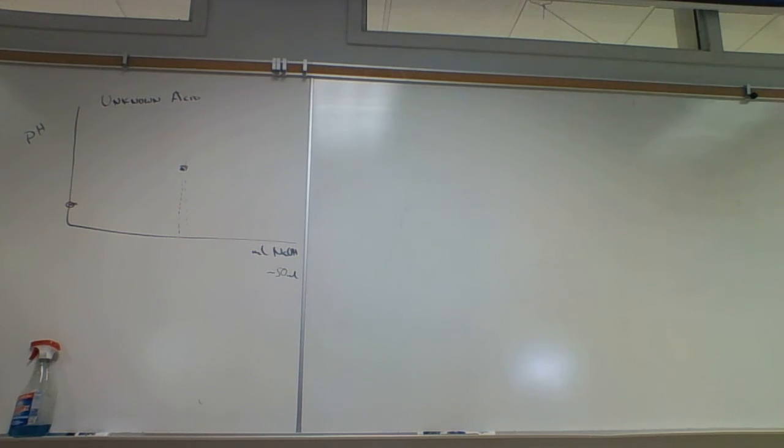So we'll do that on Thursday. And I'll talk more about it. We'll work through it together. But today's lab, we want to get familiar with the pH meters first.